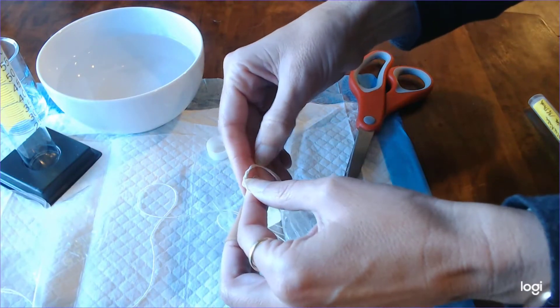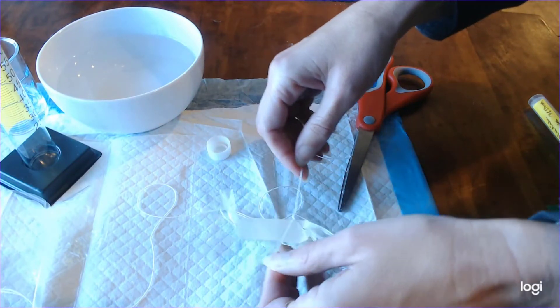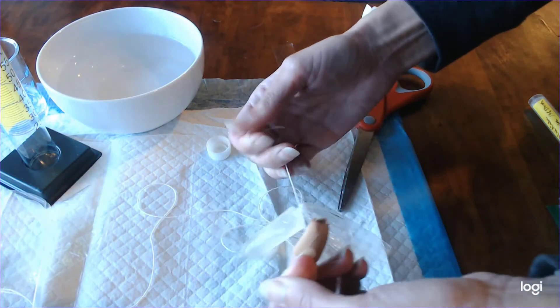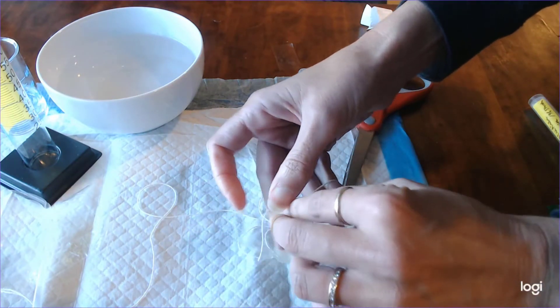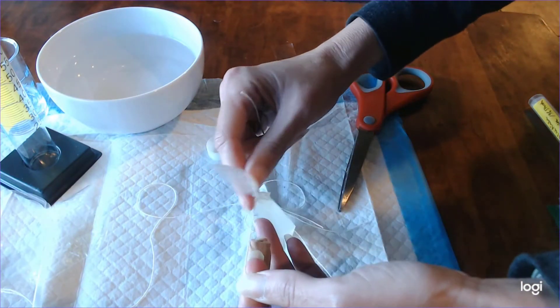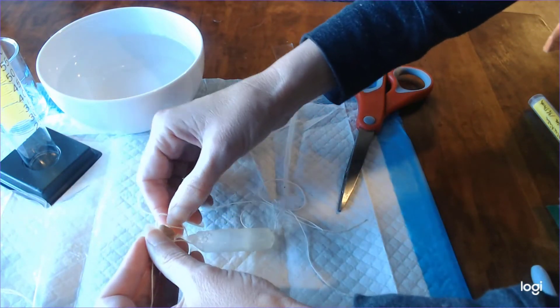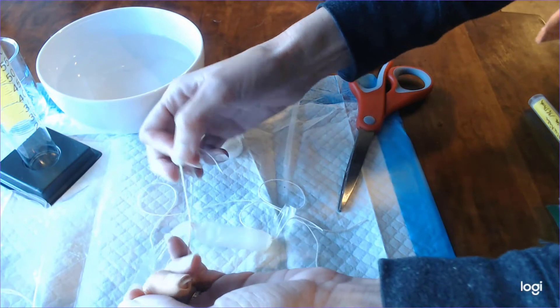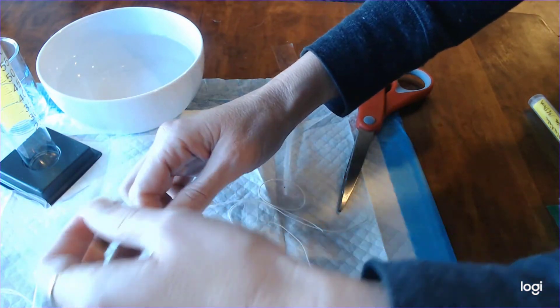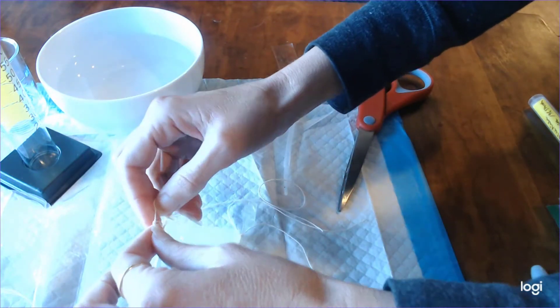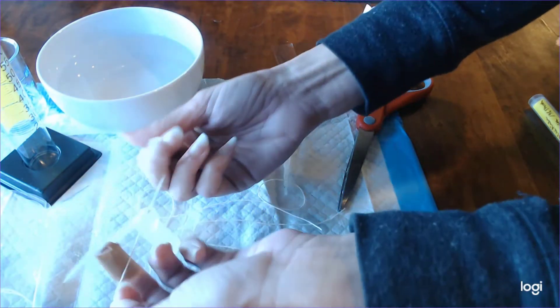So maybe a couple millimeters above where the solution ends because if water comes in you want to give the incoming fluid some room to expand so you don't want to tie it too too tightly. You want to make sure there's a little bit of play in that dialysis bag. You can kind of see where I'm tying, it's just a little bit above where the solution ends.